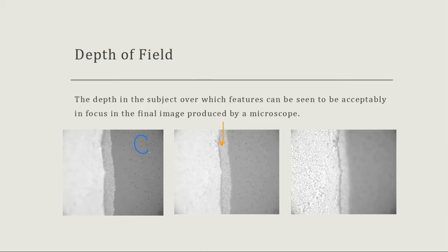So I'm going to put W for tungsten. And that last image that's in focus, I'll use red. This is a solder. So I'm going to put M for metal, but it's a solder. And so what you're looking at is your ceramic material, your tungsten, and your metal solder.